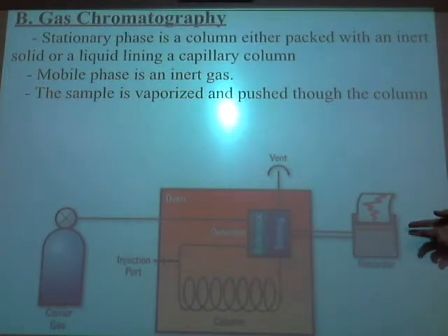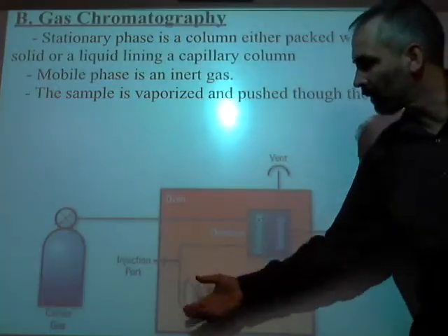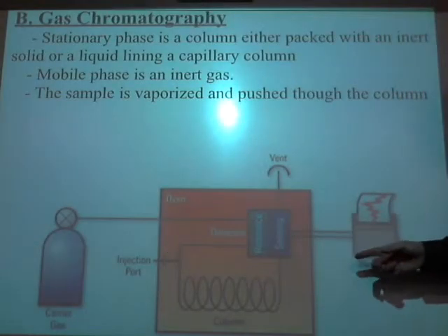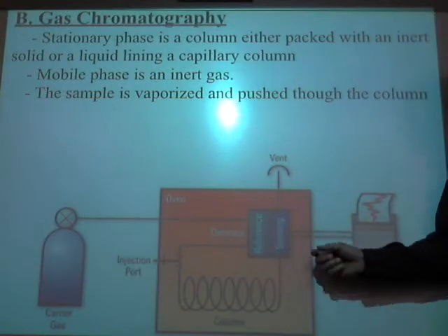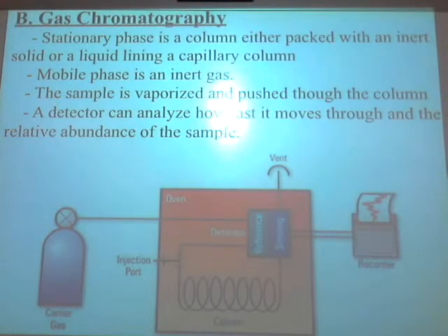At the other end of the machine is a detector. Here's all the parts right here. Here's your gas cylinder. Here's where you inject it. An oven heats it and pushes it through the column. At the other end, you get a readout, a peak. A detector analyzes it. There are a lot of different kinds of detectors. It could just measure how much of something you have and when it comes out, or it can be a mass spectrometer, in which case it can tell you pretty much the makeup of that thing. It can actually identify it.